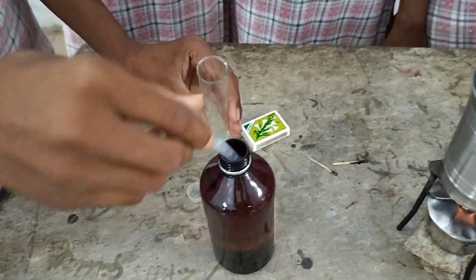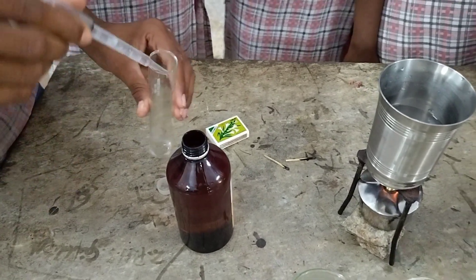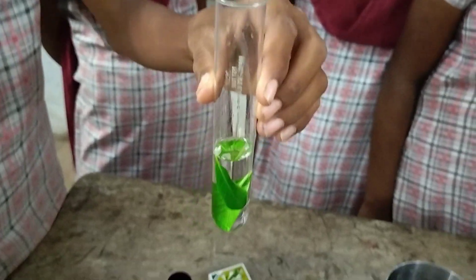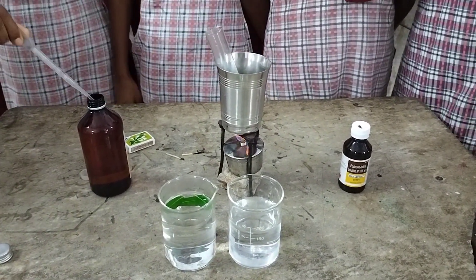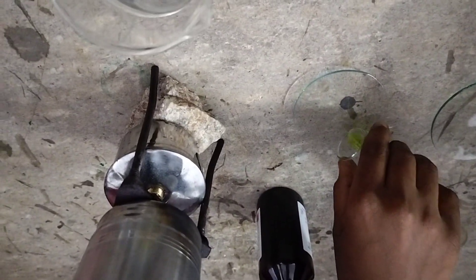Why are we heating the water in the glass? Because we should not directly heat the methylated spirit. We take the spirit in the test tube because methylated spirit dissolves the chlorophyll present inside the leaf. So I placed the leaves in the spirit and kept the test tube in boiling water — heating the methylated spirit indirectly. The water heats the methylated spirit inside the test tube.